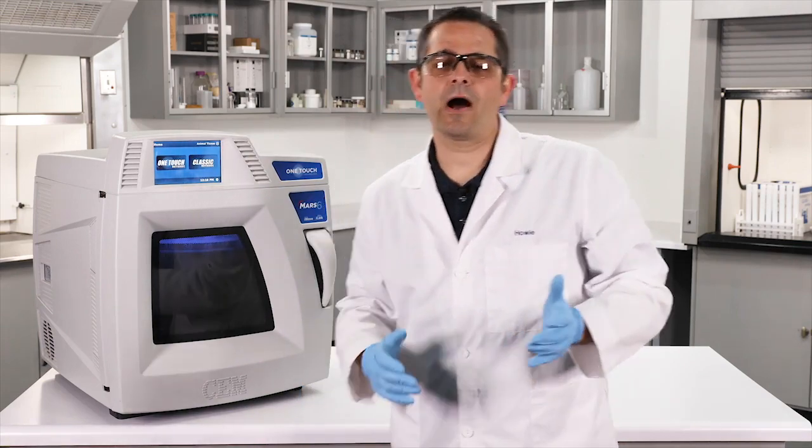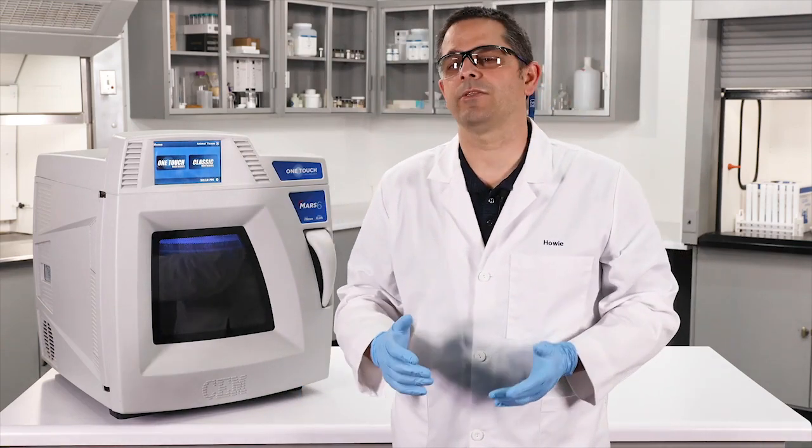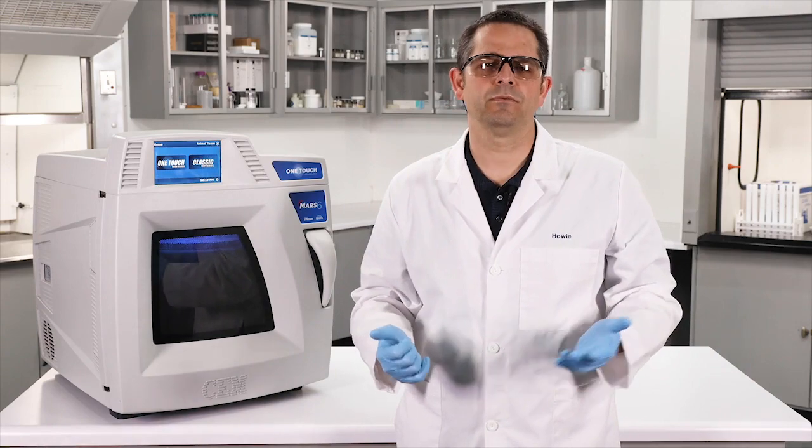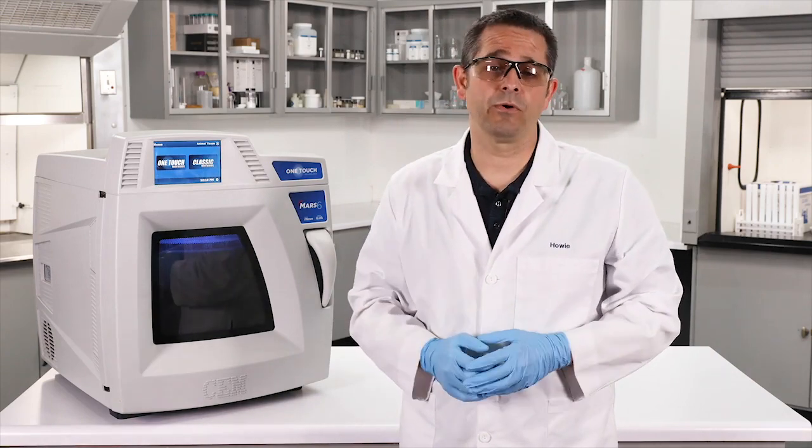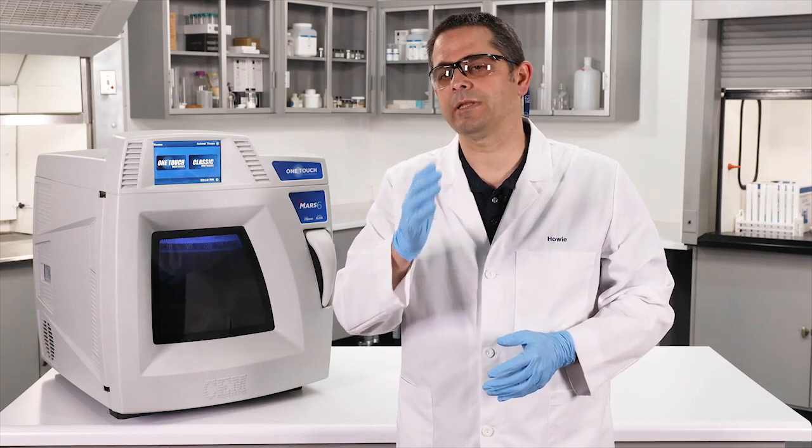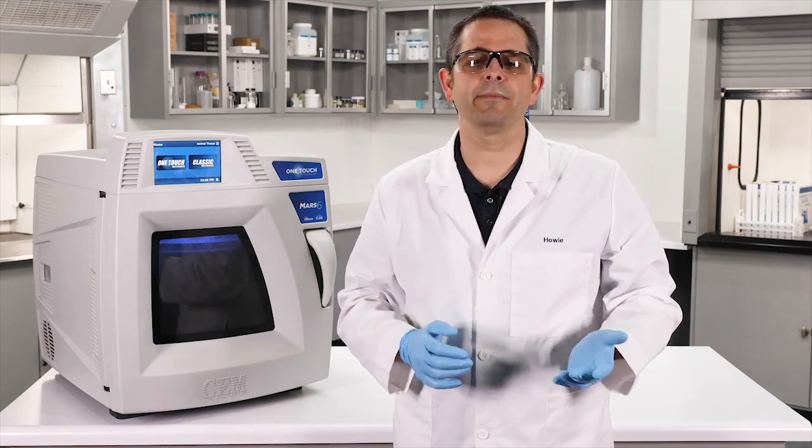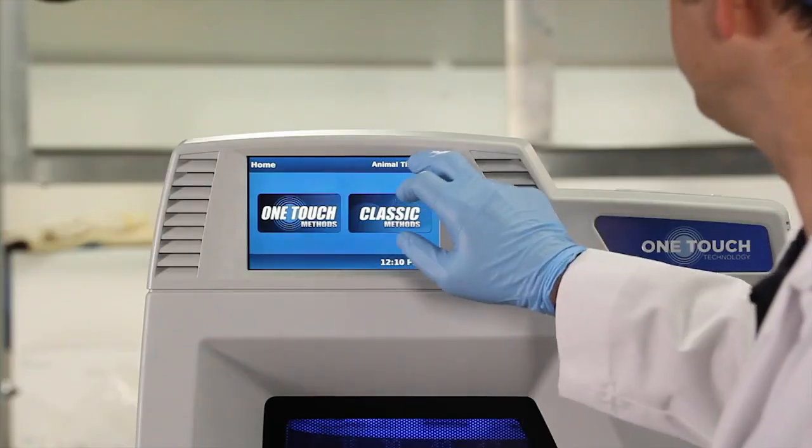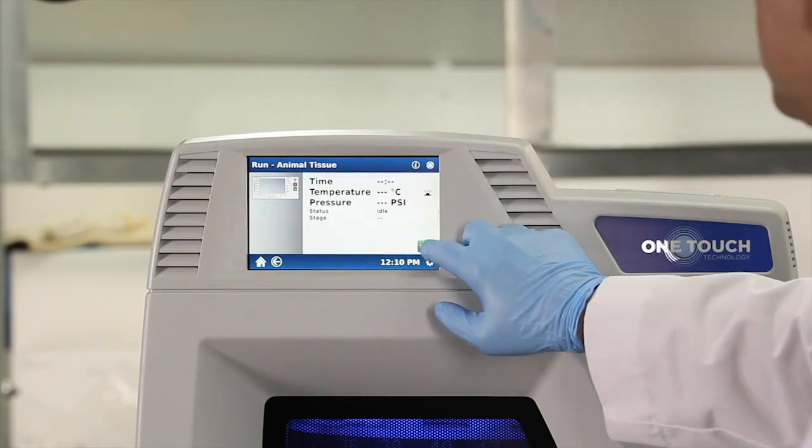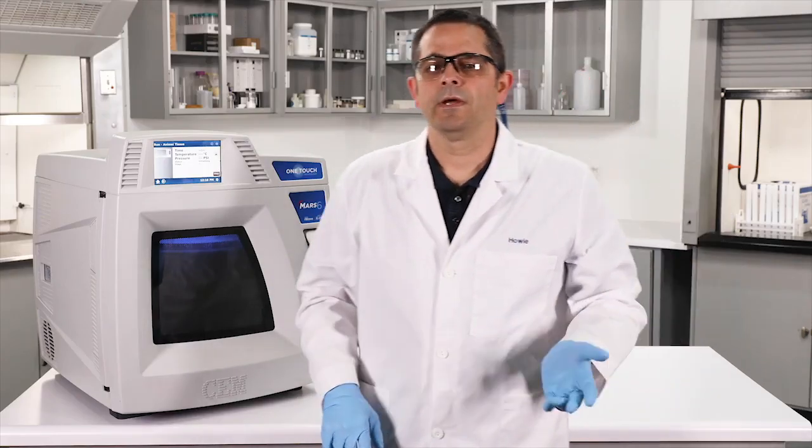All right, we have the samples loaded. Now I do not have a one-touch leather method, but animal tissue is close enough and it will get me to 200 degrees C, which will be needed to completely break down the matrix. Let me choose that and press start. Here's our animal tissue one-touch. While the samples are digested, let's get on the world wide web and take a look at the history of the origins of football.